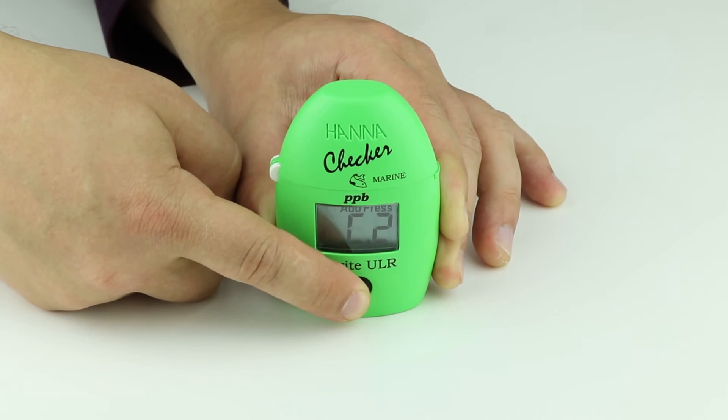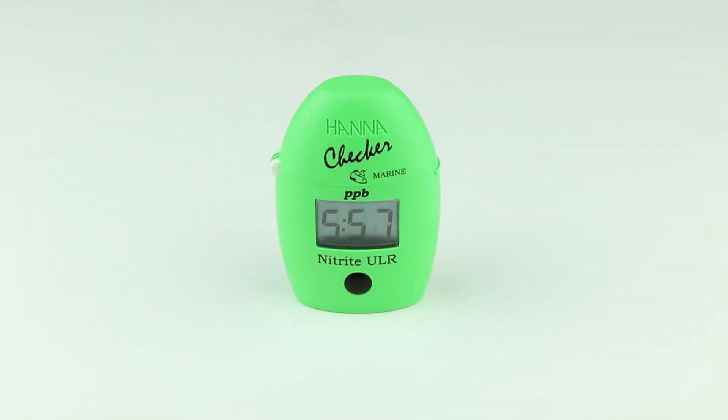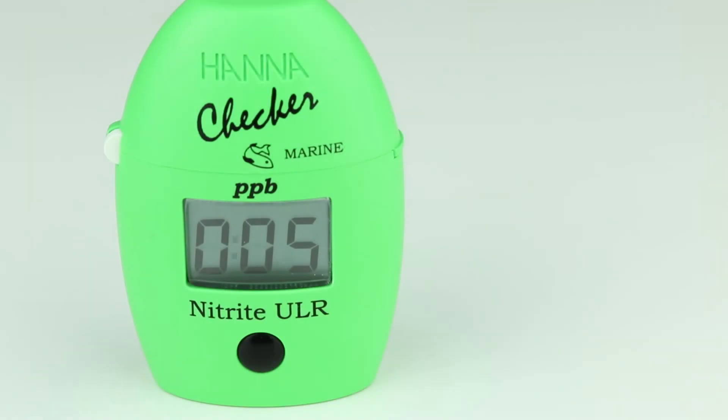Press and hold the button until the timer is displayed on the screen. A six-minute countdown will begin.